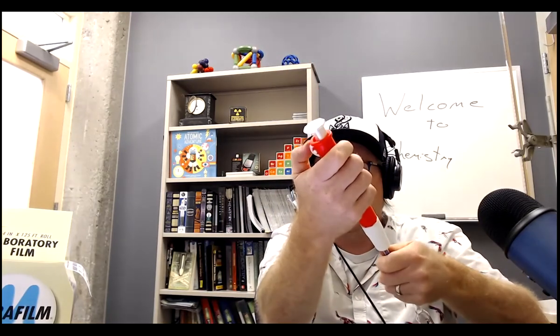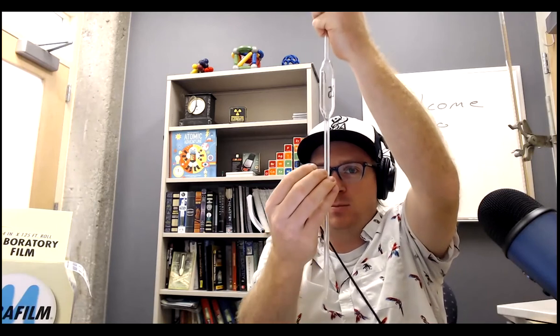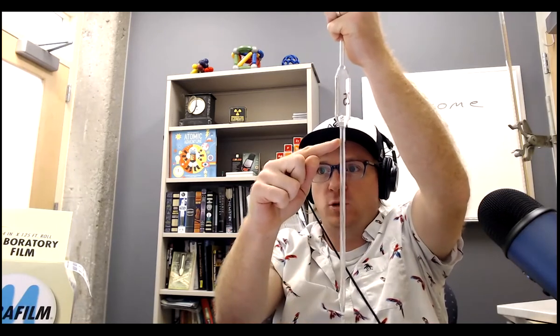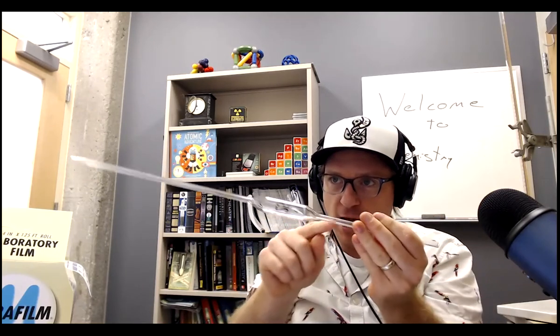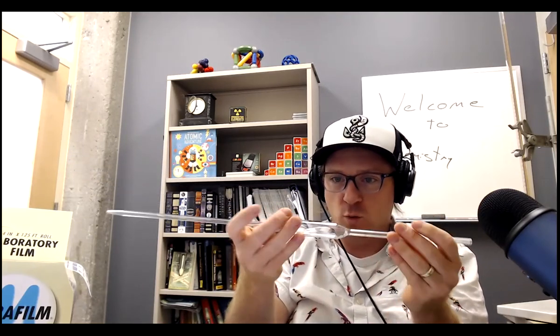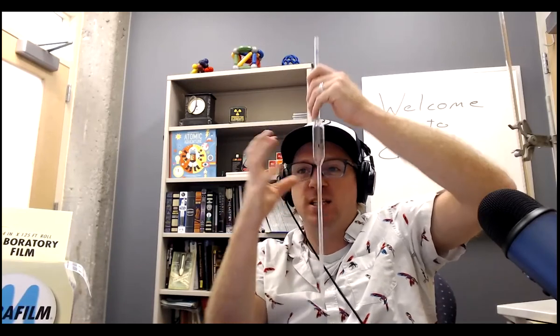So when I dial up here, the plunger comes up and it sucks the liquid up into the pipette. You probably only want to pull up to about here to do a rinse. And then you pull the top off, cover it with your thumb. And you want to roll the liquid around, cover every surface up to the line. So roll it all around really good and then dump it out. You've now rinsed the pipette. It's now ready to deliver your exact solution to a clean, dry beaker.